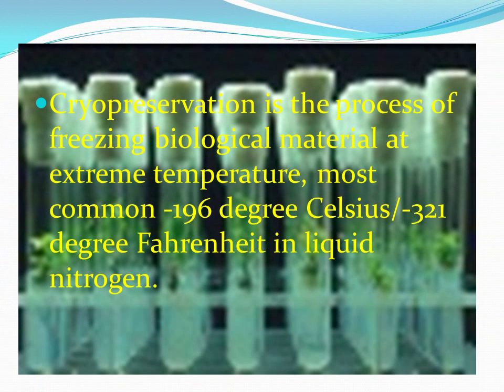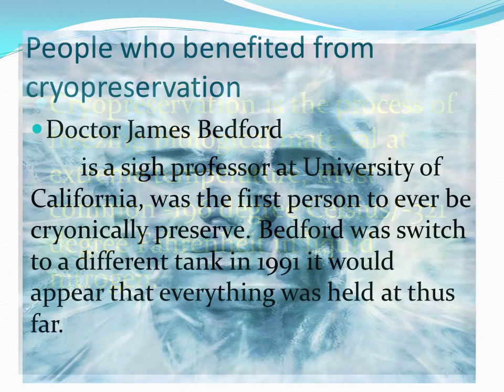Cryopreservation. Cryopreservation is the process of freezing biological material at extreme temperature. Most commonly, negative 196 degrees Celsius or negative 321 degrees Fahrenheit in liquid nitrogen.